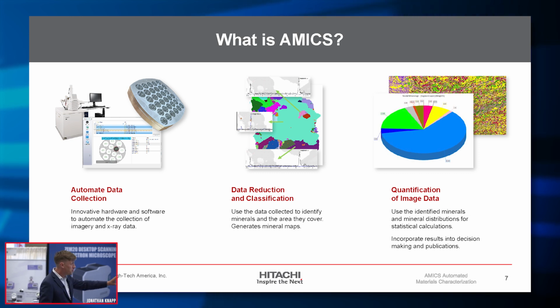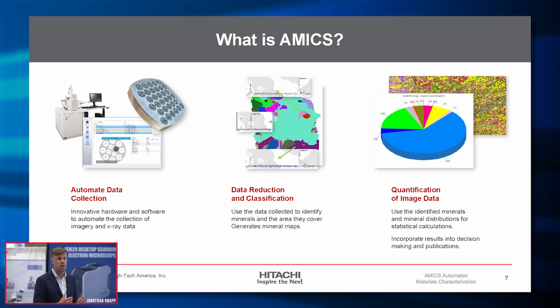What does AMICS do? The first is it automates data collection, right? So these are automation routines, and you can see kind of what a typical sample holder looks like. The whole point is to put many samples in the system at once, design your data collection routine, and push a button and walk away from the SEM. And this is collecting large area mapping and collecting EDS data and imagery data at the same time.